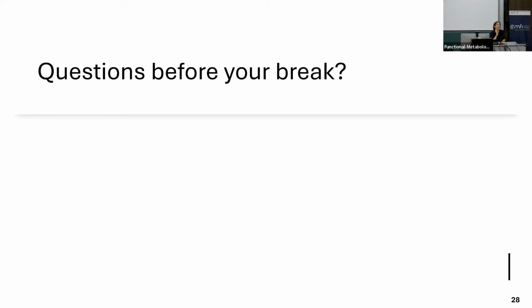Then you only capture the technical measurement error, but you also have a technical extraction error. Exactly, so I think you have to split it up. The technical replicate can be different things. It can be the technical measurement error, which is repeated injection of the same thing. It can be technical extraction plus injection, because you always get this as well, if you have exactly the same material and do the extraction and then inject it again. So I think you have to split this up. Then your samples go up exponentially.